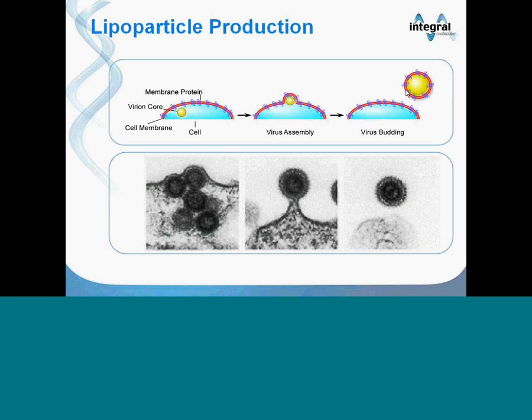From the stock concentration, we typically dilute them 10 to 20 fold. And how much would you get in a stock solution? Well, they're sold in 100 microliter aliquots. Okay, thank you. You're welcome.